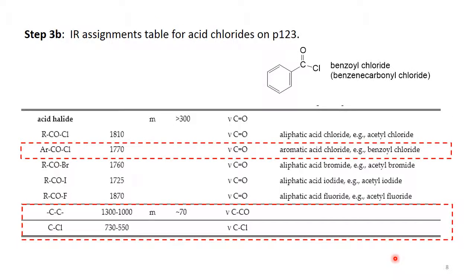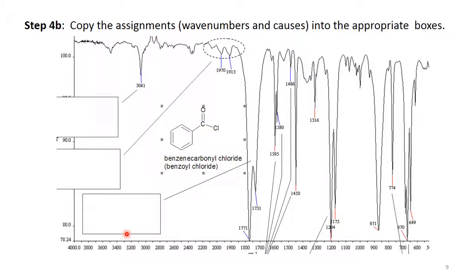Here is the assignment table for acid chlorides. For the aromatic acid chloride, the carbonyl stretch is at 1770 wavenumbers, with a C-to-CO stretch between 1000 and 1300 wavenumbers, and a C-to-Cl stretch between 730 and 550 wavenumbers. Here is the scan of benzoyl chloride — you should not have too much difficulty finding the carbonyl stretch. There is some splitting, but nothing else like a carbonyl absorbs in this region.